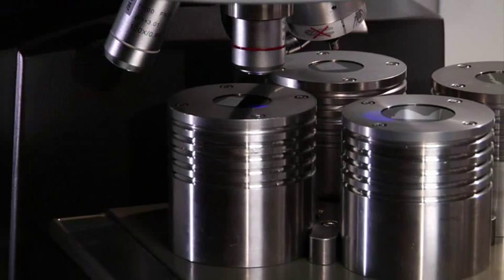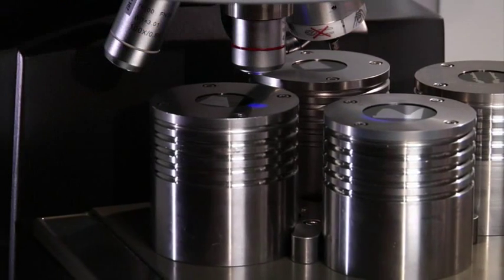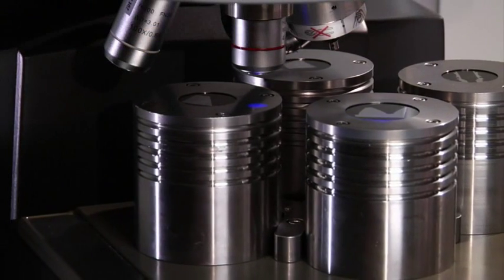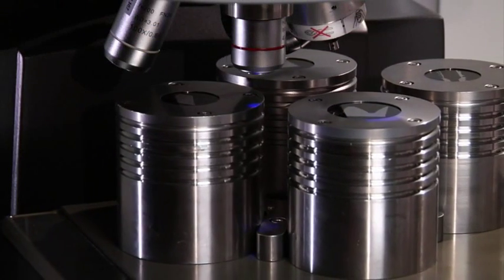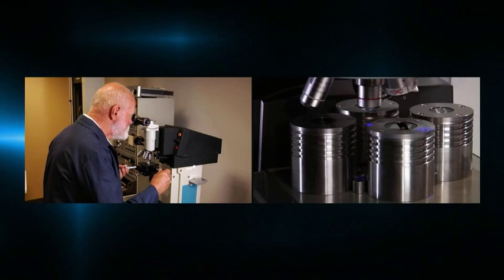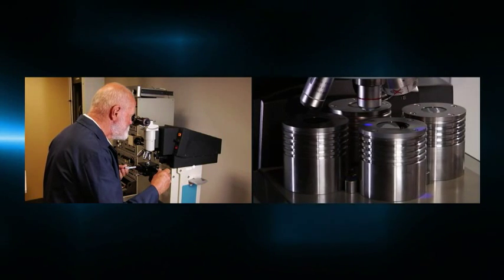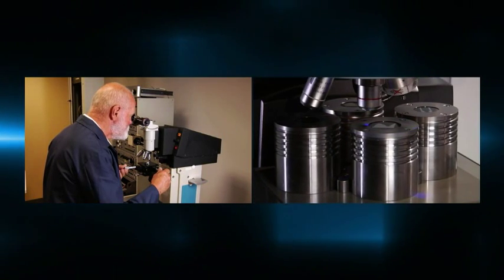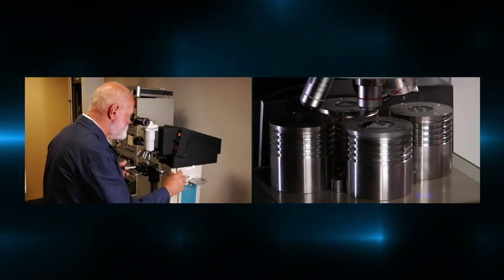The Toucan 2500 provides a fast and accurate means of testing compared to the manual, time-consuming testing practices of conventional hardness testers.